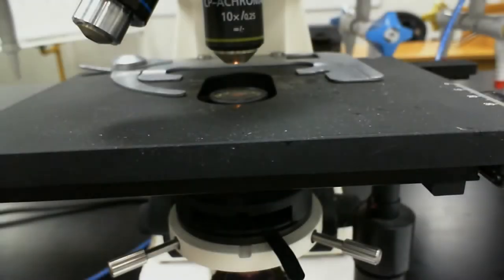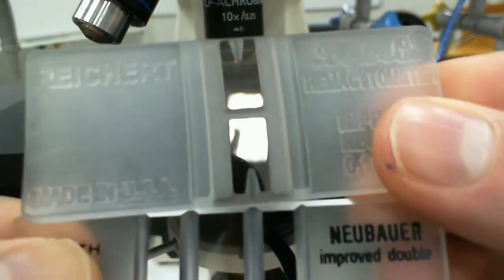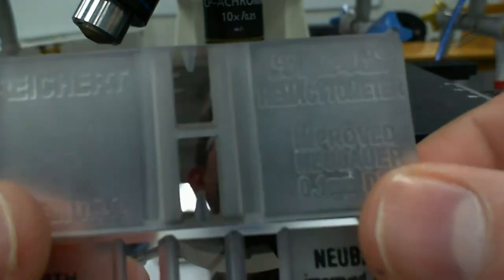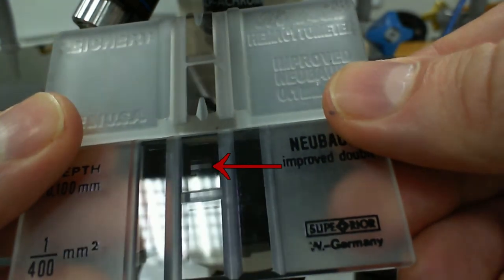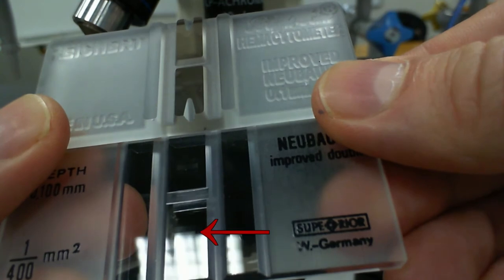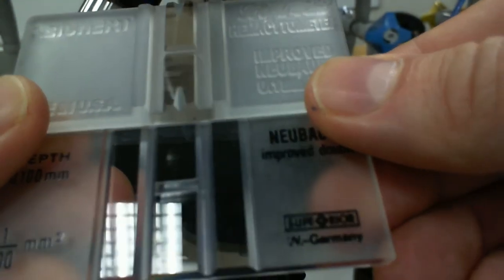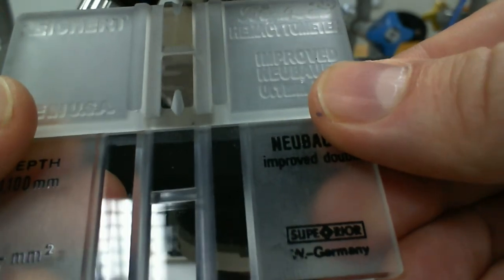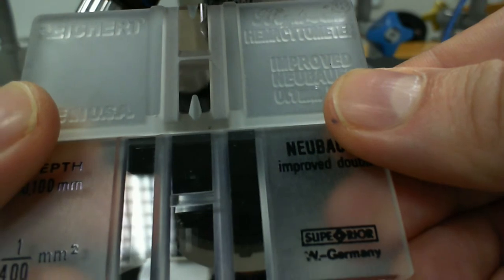There's one more thing I want to tell you about. We have two types of these slides. So these are two sets of counting chambers. This one at the bottom is the one we just used. Oh, you can actually see the grid. In this case here on both sides, some of the etching is visible on the slide right now. Okay, there it is. So the one at the bottom is the one we just filled.